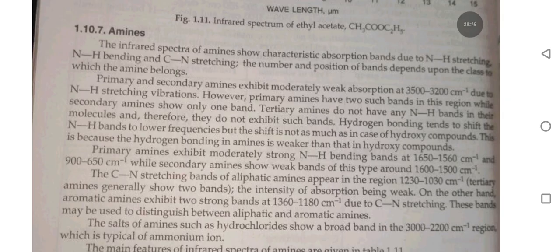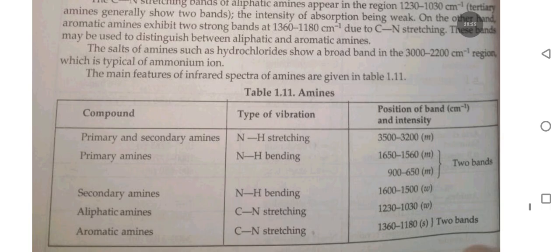On the other hand, aromatic amines exhibit two strong bands at 1360 to 1180 cm⁻¹ due to CN stretching. These bands may be used to distinguish between aliphatic and aromatic amines. The salts of amines, such as hydrochlorides, show a broad band in the 3000 to 2200 cm⁻¹ region, which is typical of the ammonium ion. The main features of infrared spectra of amines are given in Table 1.11.